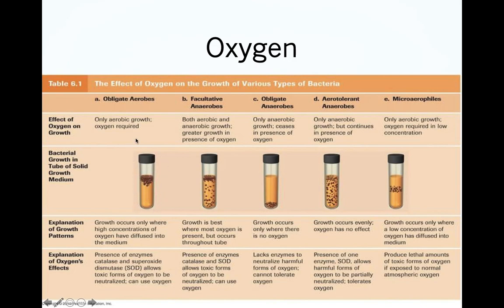If you know anything about how oxygen dissolves into water or media, the closer you get towards the surface, the more oxygen is going to be dissolved. The farther away from the surface that you get, the less oxygen there is. Same kind of concept with a fish tank. Closer to the surface, the more oxygen. The farther down you go, the less oxygen. So, you introduce a brand new sample of bacteria to this sterile test tube. They will orient themselves into the location that's best for them.